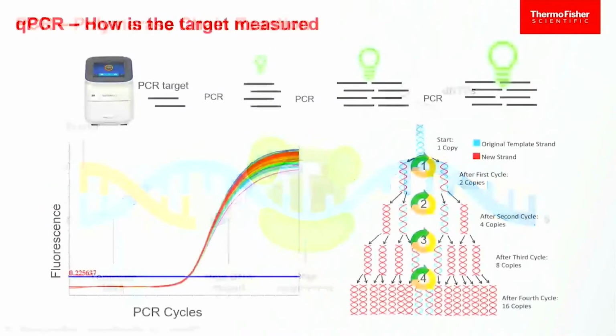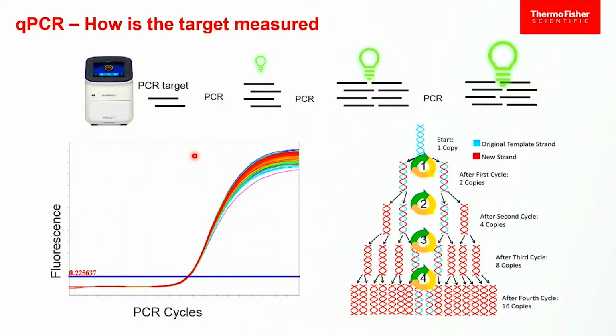All right, so again, we had that twofold amplification process, which is represented again slightly differently on the right. And the difference between PCR and qPCR is up here at the top. We do the cycle. We take one molecule, we make two molecules. We then measure that between every cycle, and we count how much did I make.